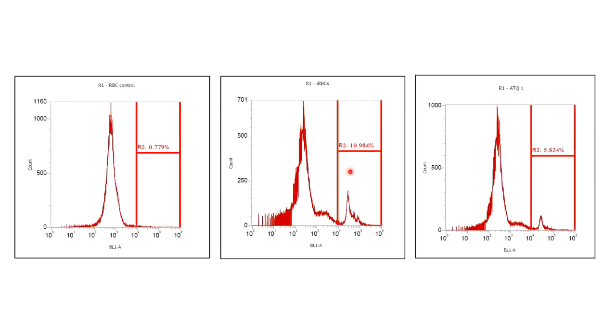This is the last thing of today's lecture. It is our experiment, and I personally like this experiment a lot. So imagine you are working on an anti-malarial drug, and you are saying that by my drug the plasmodium will die.